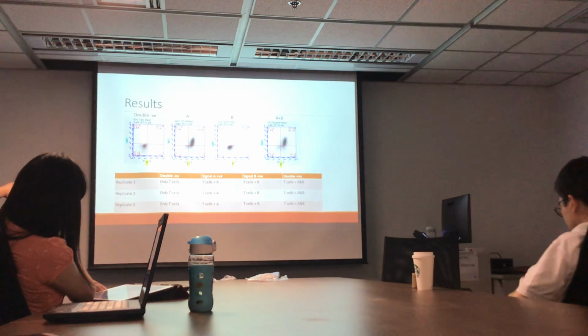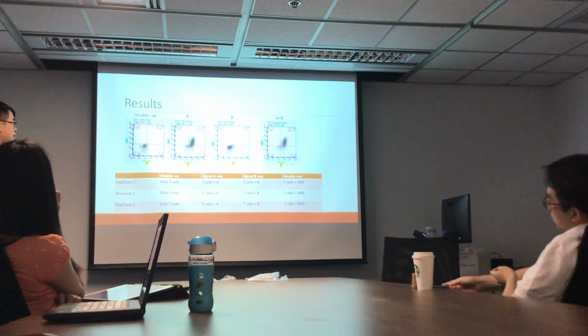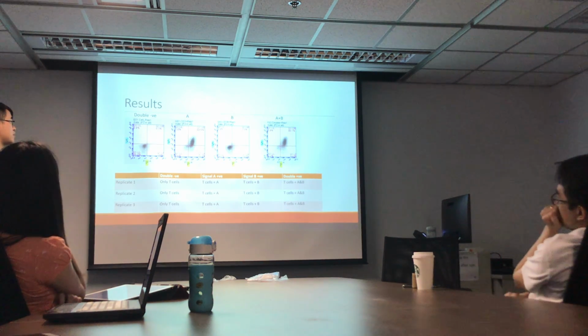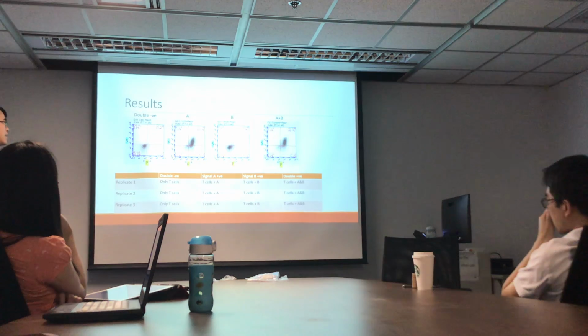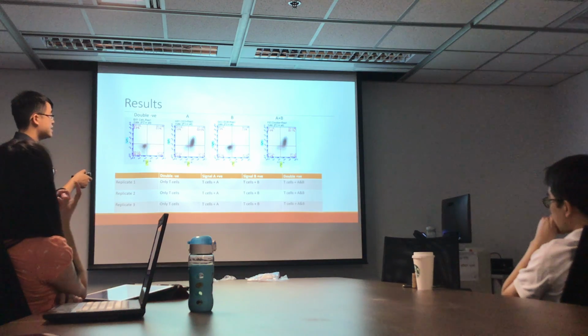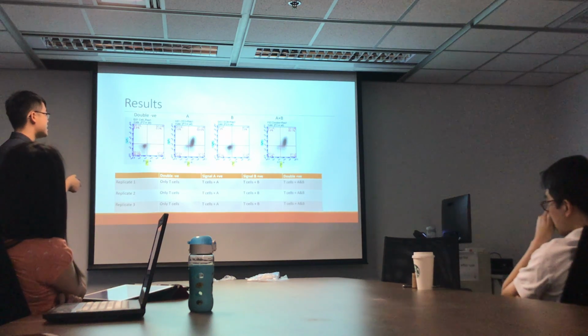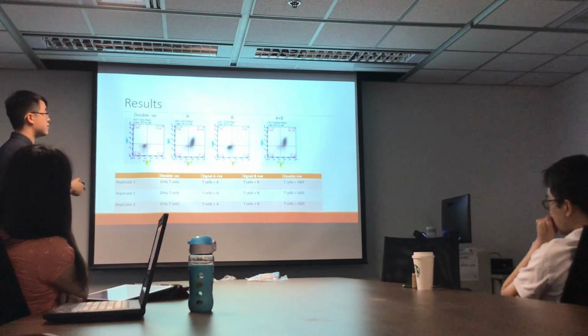Whereas the T cells with signal B have a very similar level, judging from the diagram, to the double negative samples, which suggests very little to no activation. The combination of A plus B also demonstrates a higher P and S signal compared to the baseline, suggesting that this population of cells is activated.